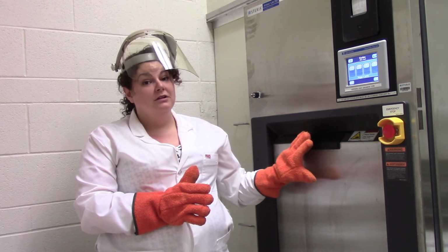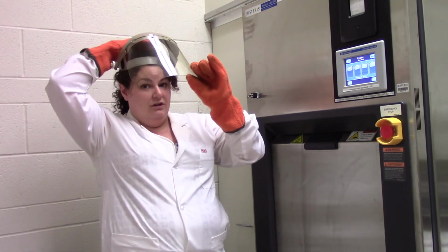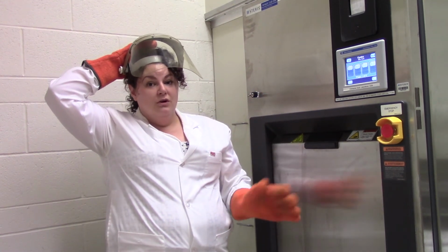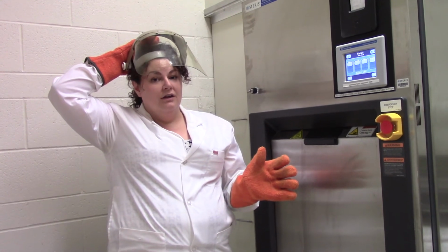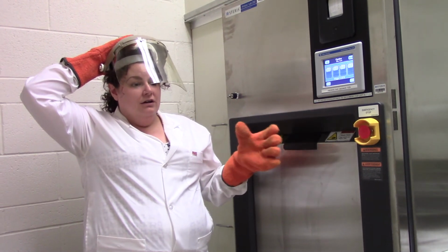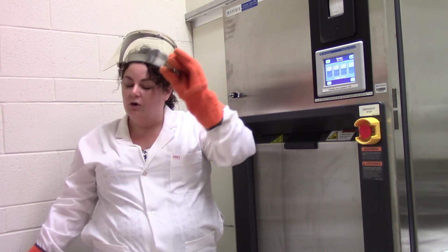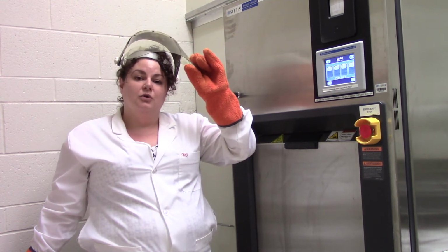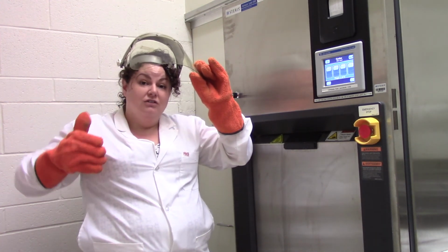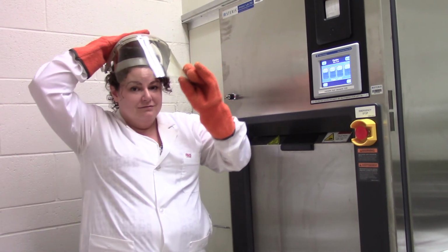Now there's going to be a lot of built-up steam in the autoclave, so here is where it's extra important to make sure that you've got your face shield on, your gloves are on, and when you open the door, you're going to step right away from it. And then once the steam has dissipated a little bit, you can carefully reach in with your gloved hands and grab your materials and bring them over to the stainless steel cart to let them cool down a little bit. So I'm going to go ahead and demonstrate that. I'm going to have the face shield on so I won't be talking through it, and then I'll come back and let you know when we're done.